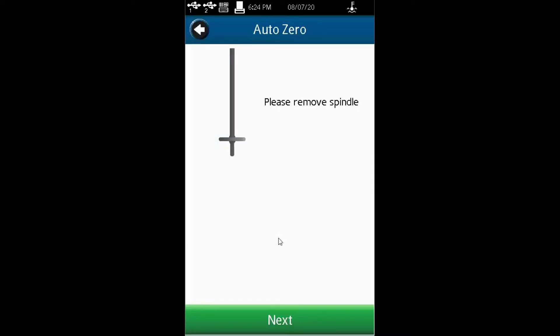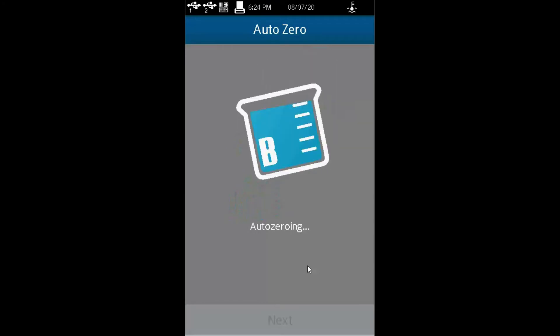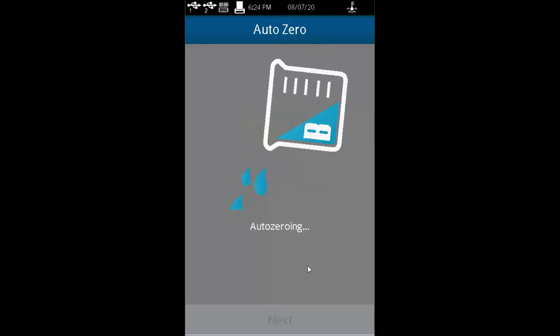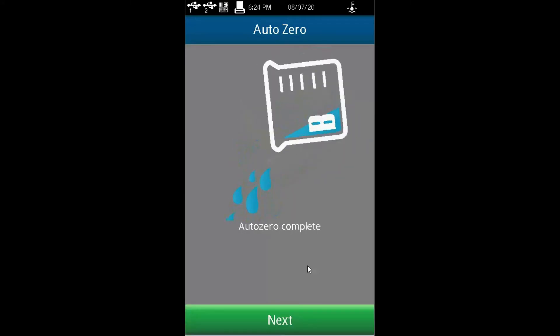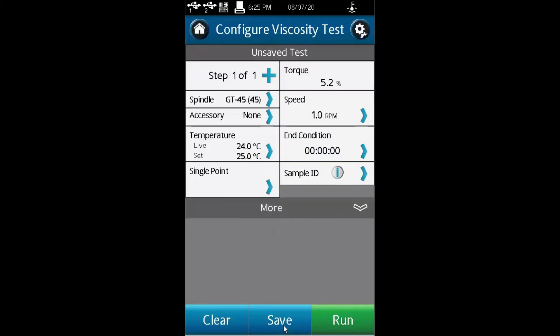Then you're told to remove the spindle. You hit next, and it does auto-zeroing automatically, which is necessary. Once it is done, you hit next.